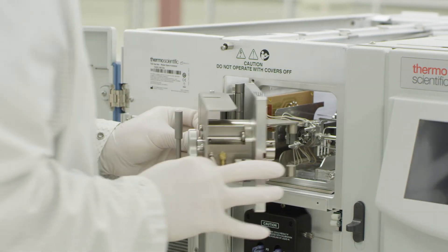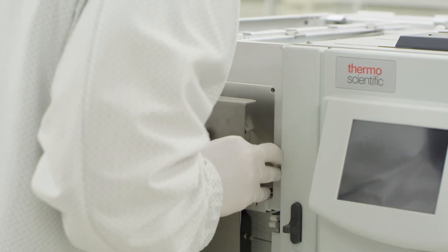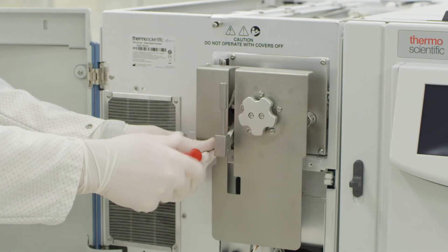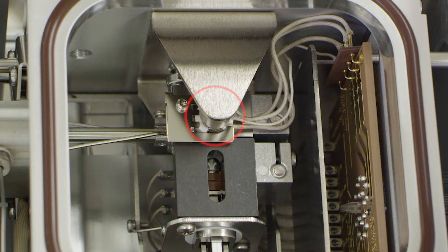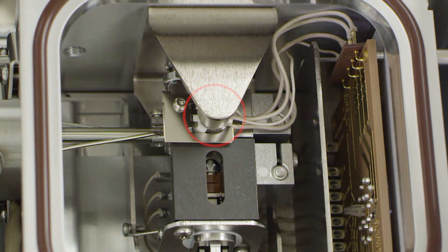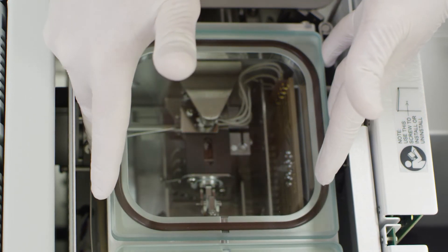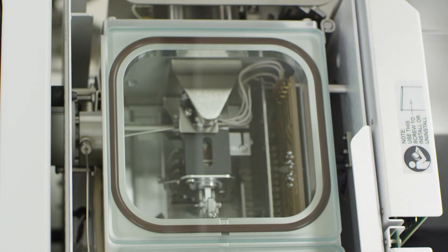Replace the manifold door in the opposite way in which it was removed. Replace the four screws which secure the manifold door to the mass spectrometer. Be sure that the magnet of the yoke is positioned directly above the filament. Replace the glass top to the assembly. Take great care to ensure that the glass cover is seated evenly. This will ensure that the instrument will be able to achieve and hold vacuum.